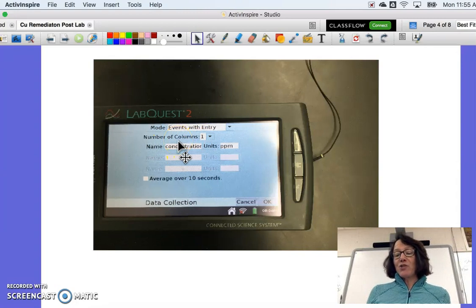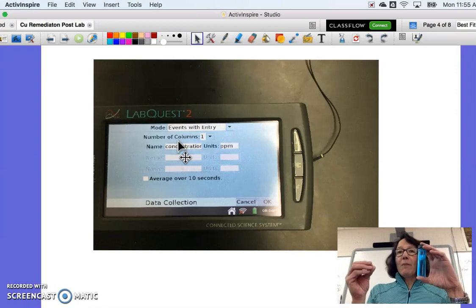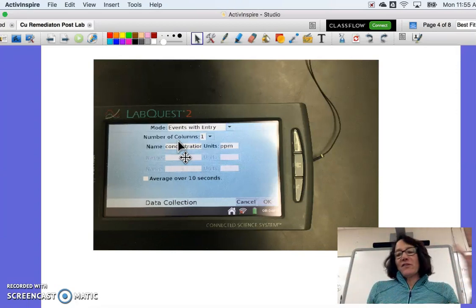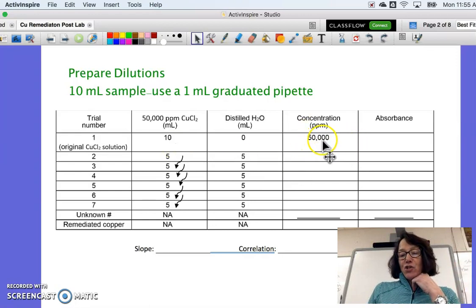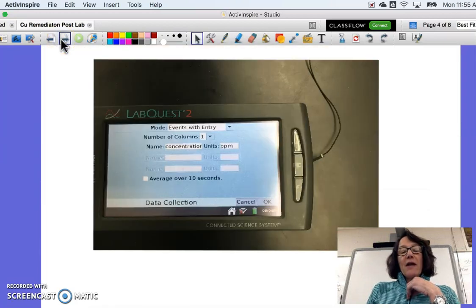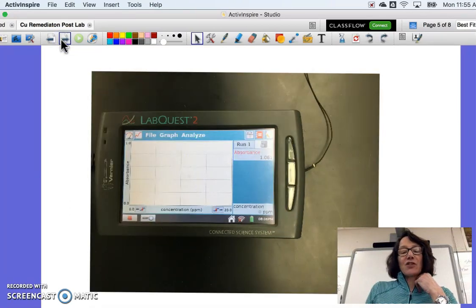The colorimeter can measure the absorbance of this dark solution, how much light is absorbed or passes through it, but it has no idea what concentration I have. So when I look back at my original data table, if I put this first test tube in there, I take the test tube full of solution, dump just enough of it in to get the cuvette 3/4 of the way full, I know the concentration of it. So when it gives me a stable absorbance reading, I go ahead and enter that corresponding concentration.